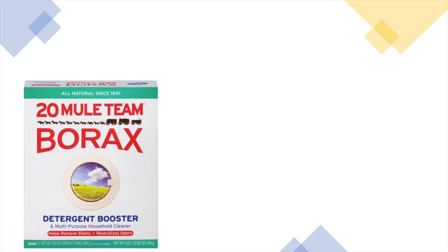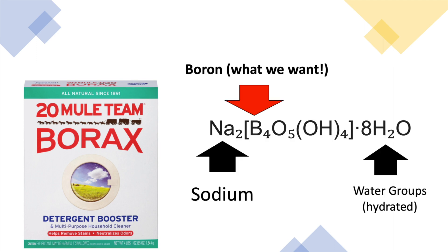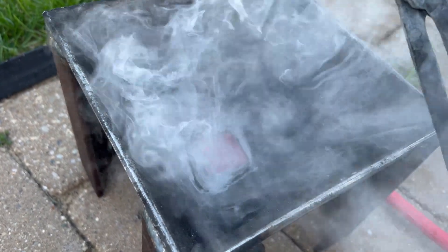Borax is a hydrated sodium boron salt. It can be found in nature as is. Borax is commonly used as a flux and household cleaning supply. I only want the boron from the borax. To do this, I will convert it to boric acid.